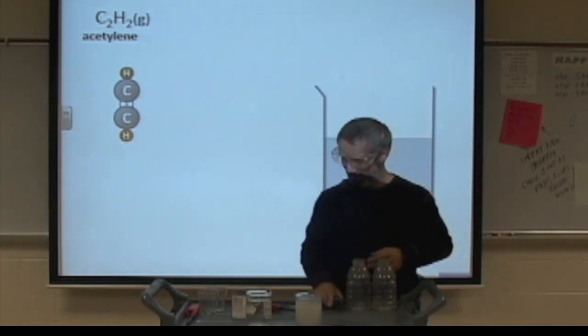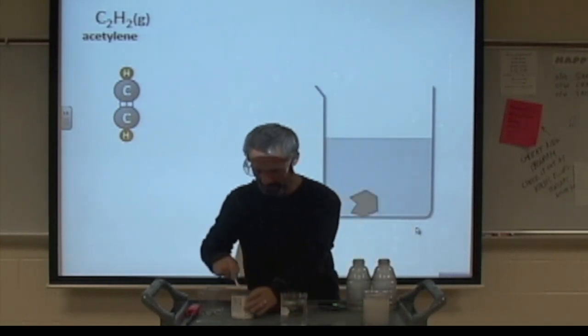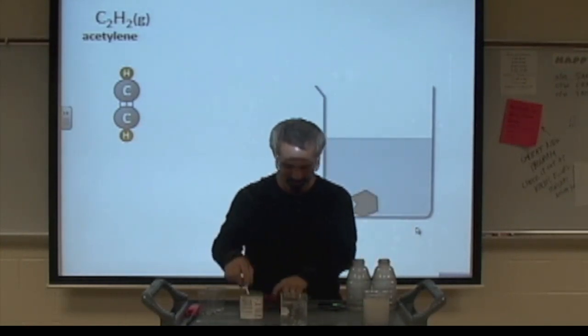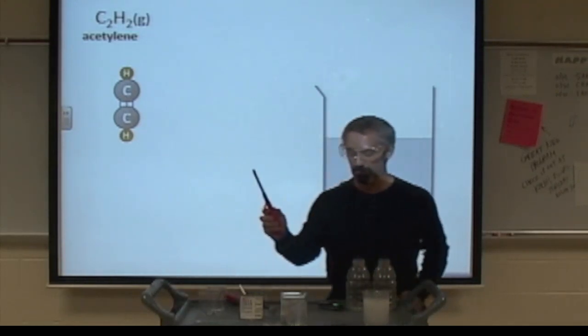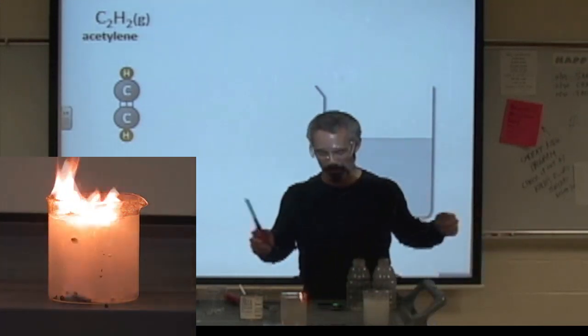That's impressive, but what's equally impressive, even more impressive, is what we can do with the acetylene gas. So that's why the second beaker. Check this out. I'm going to take that exact same reaction and all I'm interested in is the acetylene gas that's produced, because watch what I can do with it.